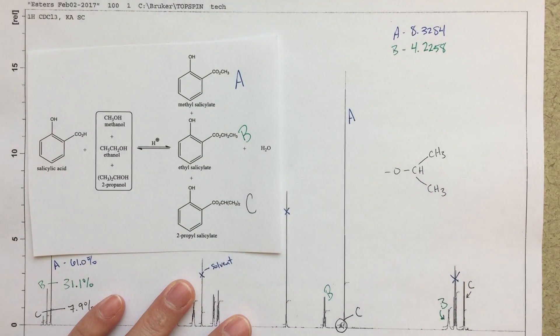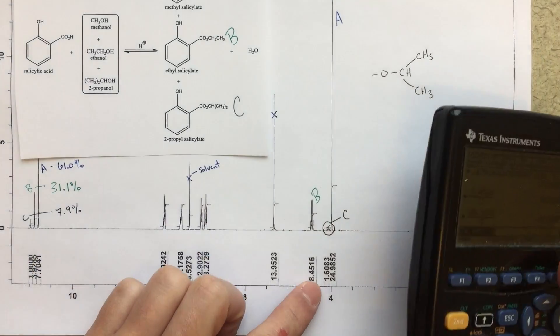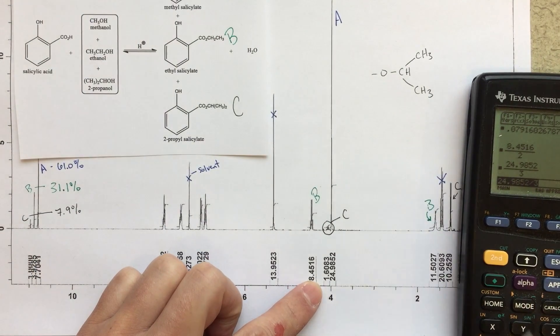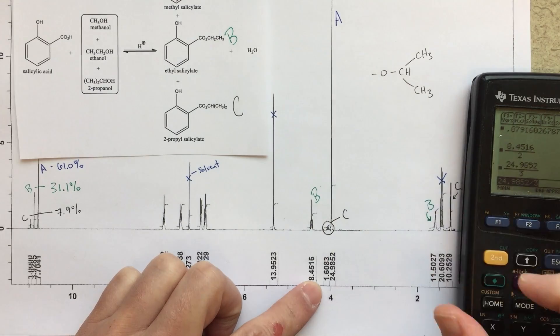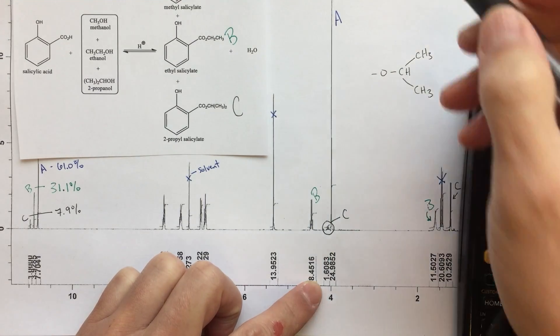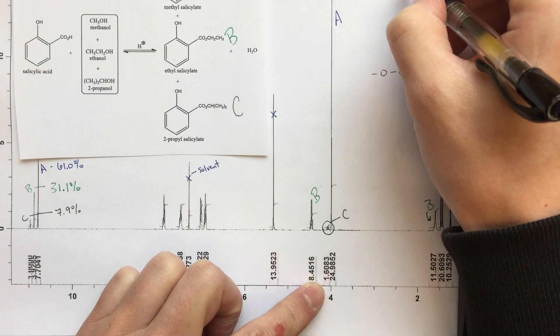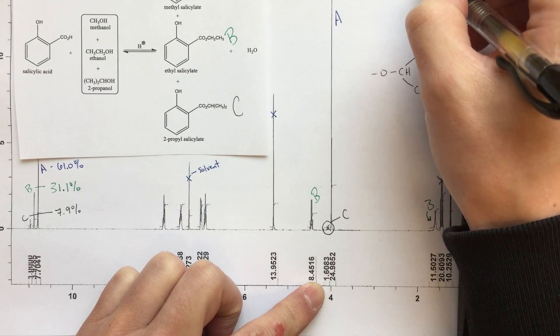And then for C, C is already sort of standardized, right? Because C is only for 1 proton, this 1 proton here. So we can just use that number of 1.6083.